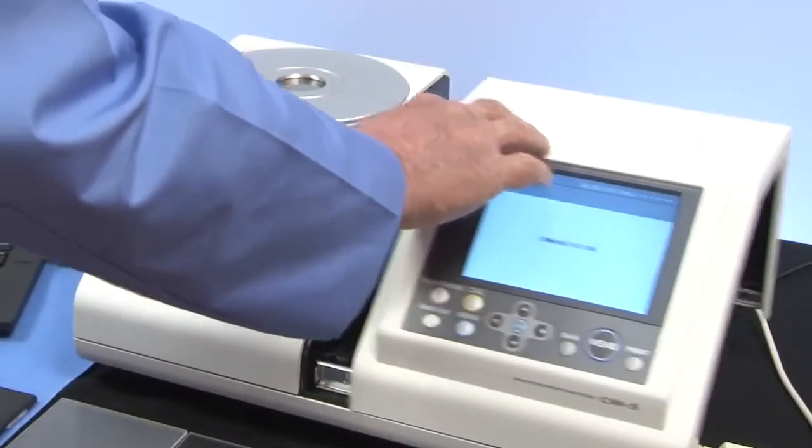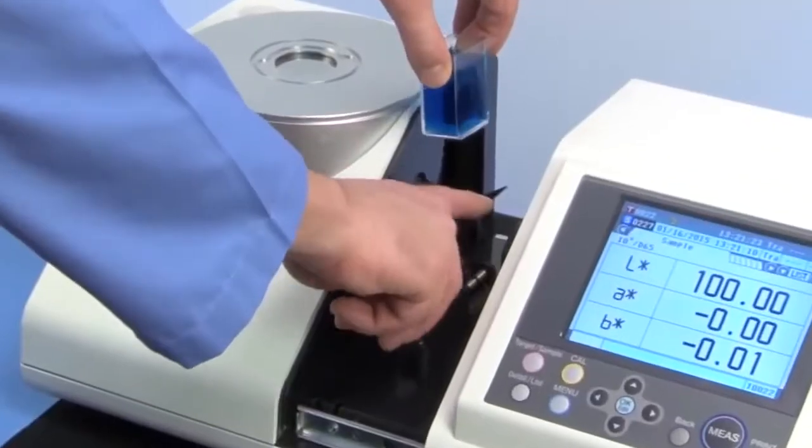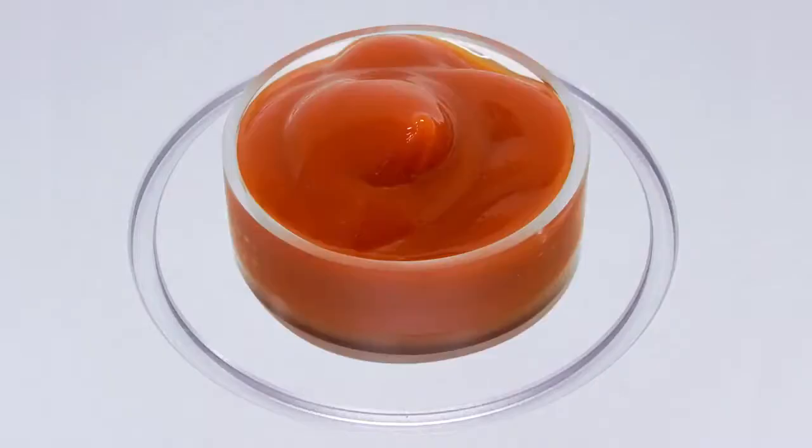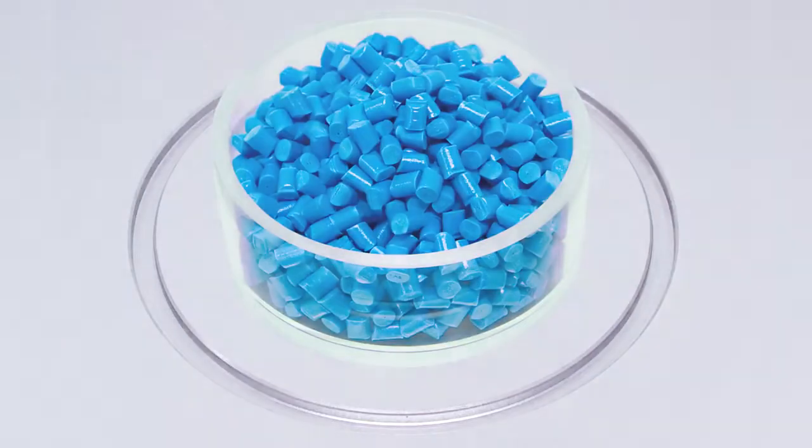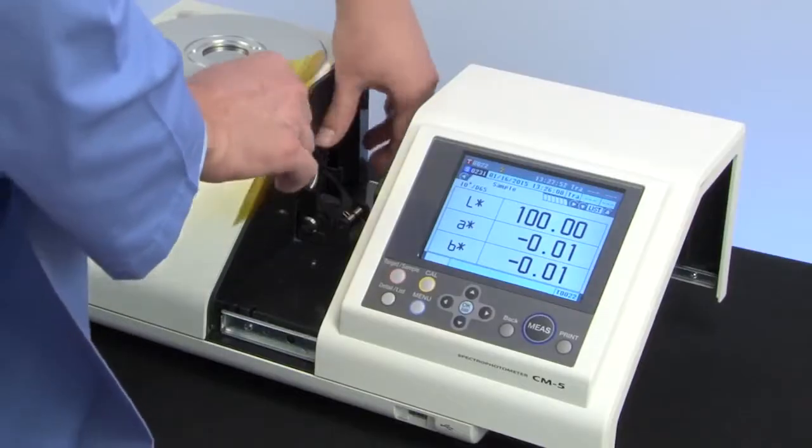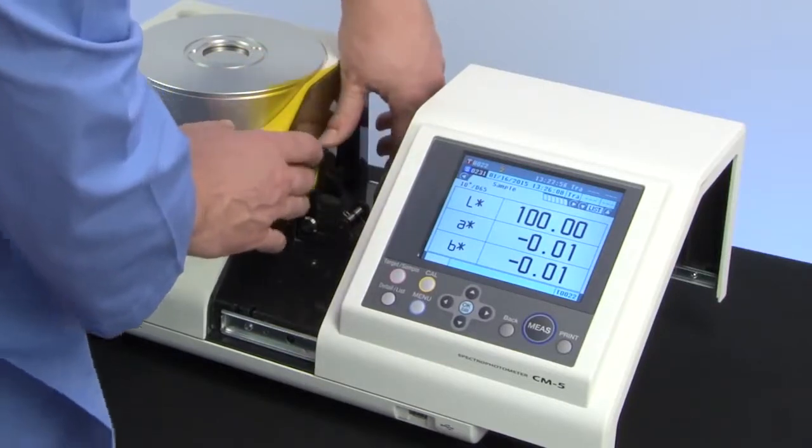The CM5 measures a variety of samples with different material characteristics such as liquids, powders, paste, and granules, as well as the haze of transparent films and glass. The transmittance chamber can hold large sheets up to 60 mm thick.